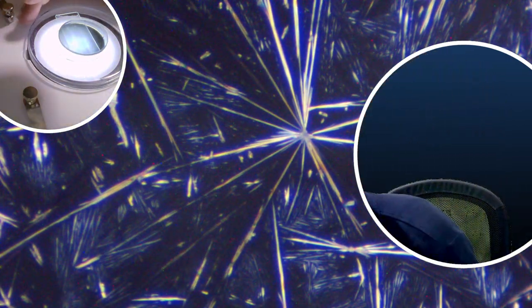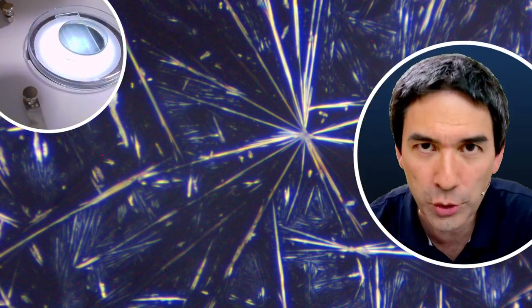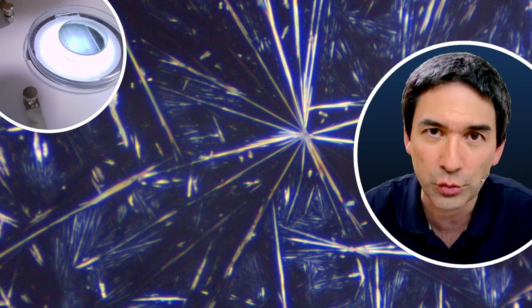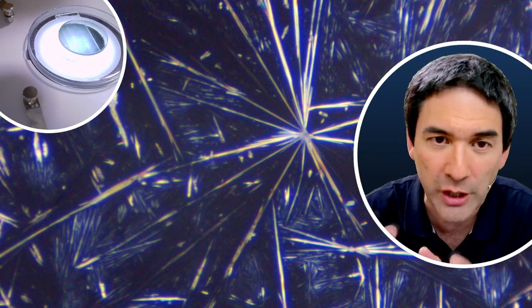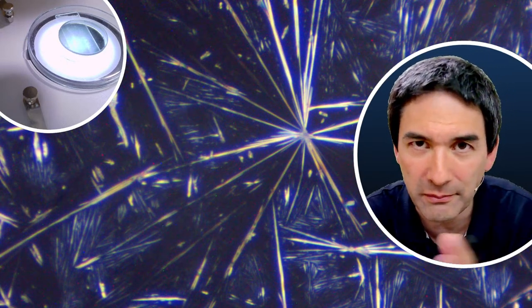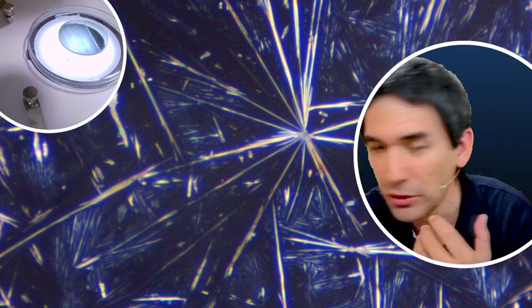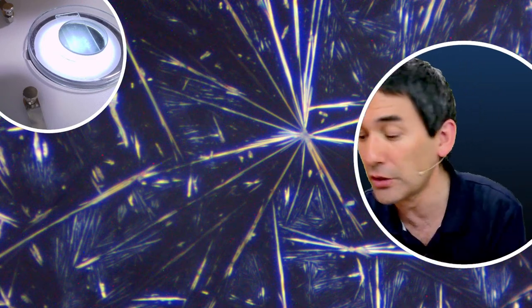If you look through the actual stereo microscope, it looks so much better because the contrast is better and the background is really black, and the crystals really shine nicely. The quality over the camera is really not as good because the camera adjusts the exposure time and everything, so you're losing a lot in this process. But just looking through it really looks very beautiful.